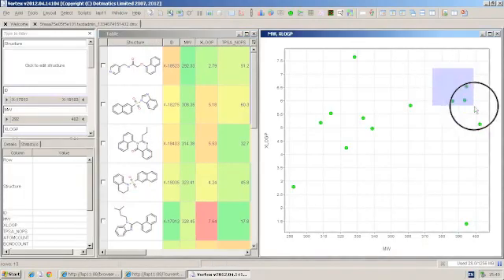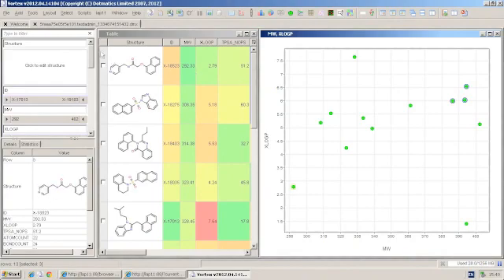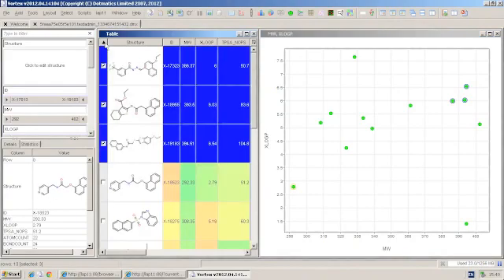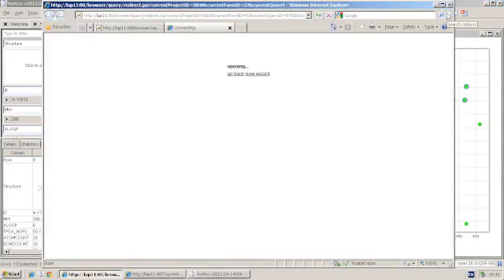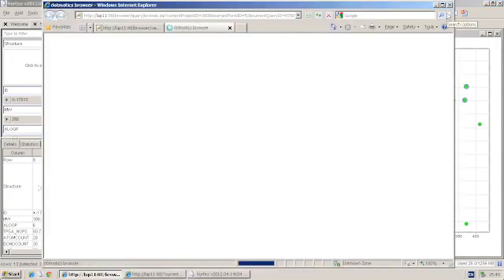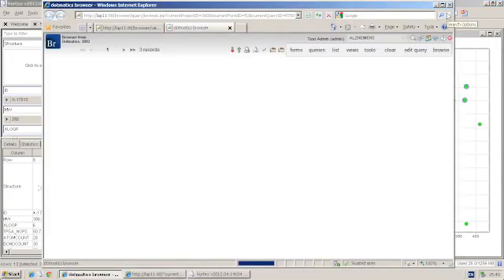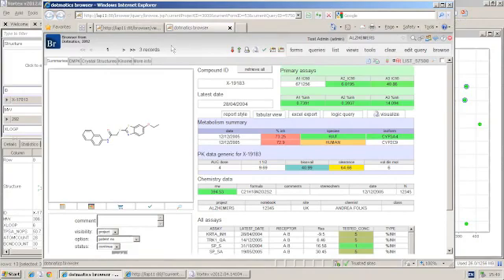If I make a selection of compounds, here are the three compounds I've selected. I can post these immediately back to Browser with one click to now see the three compounds here.